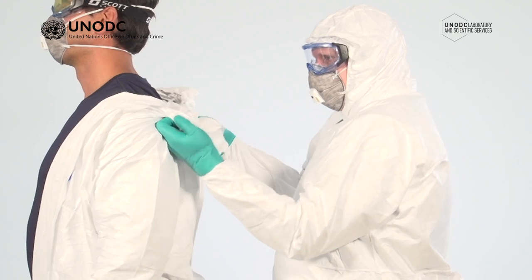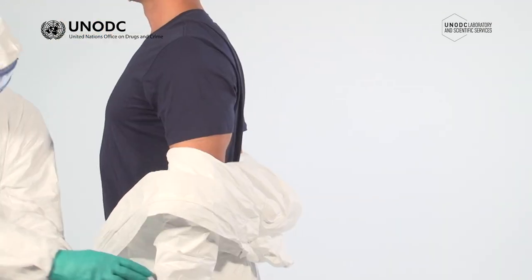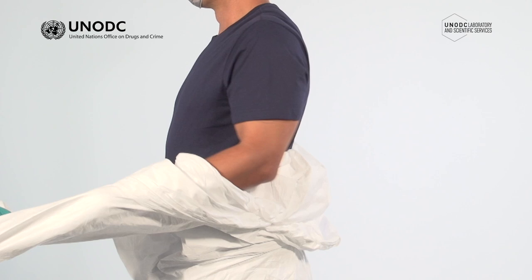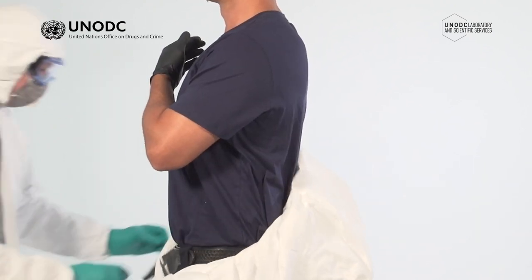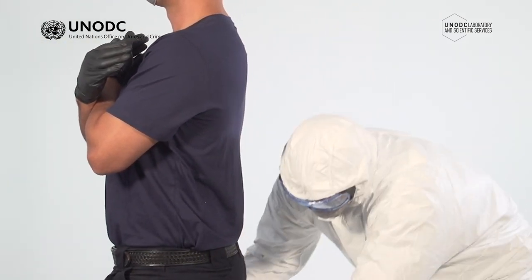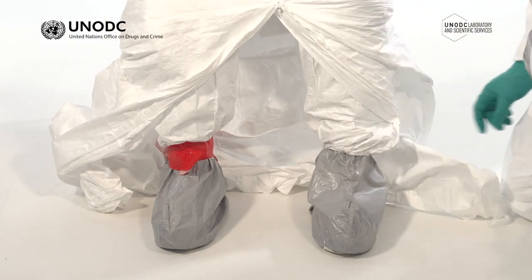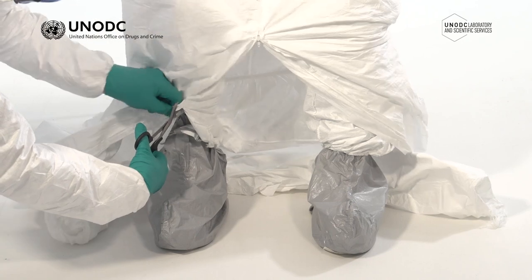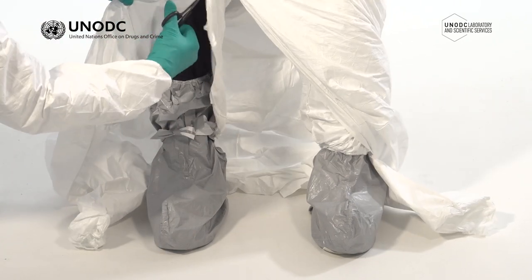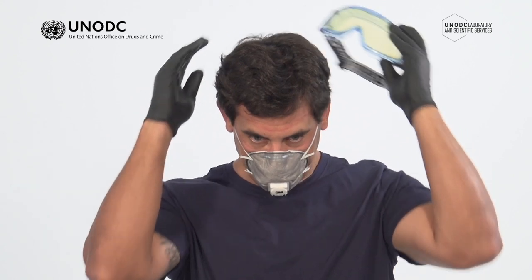The decon officer should roll the suit over your shoulders, turning it inside out as they roll it down. At this point, they should hold each sleeve and you should pull your hand and arm into your suit, cross your arms over your chest and keep them in this position. Once the suit is down below the knees, sit down on a clean surface. The decon officer may now remove the tape from the overboots. When using disposable coveralls and overboots, it's often easier to use trauma shears to cut or rip away the legs and overboots. Eye protection can now be removed, followed by the respiratory protection. It should be noted that aside from the inner nitrile gloves, respiratory protection should almost always be the last item of PPE removed.